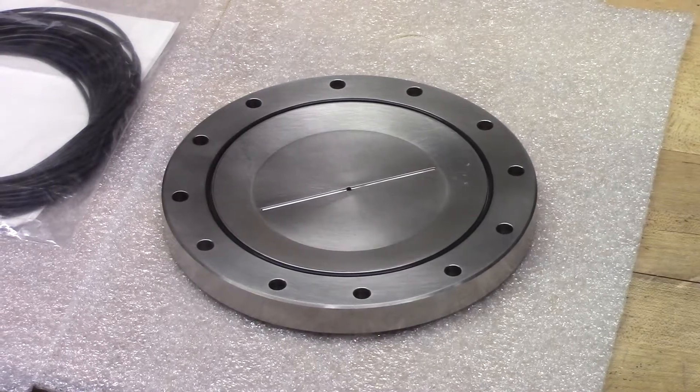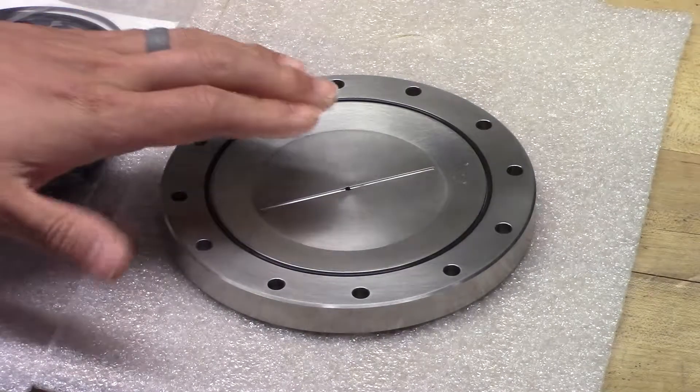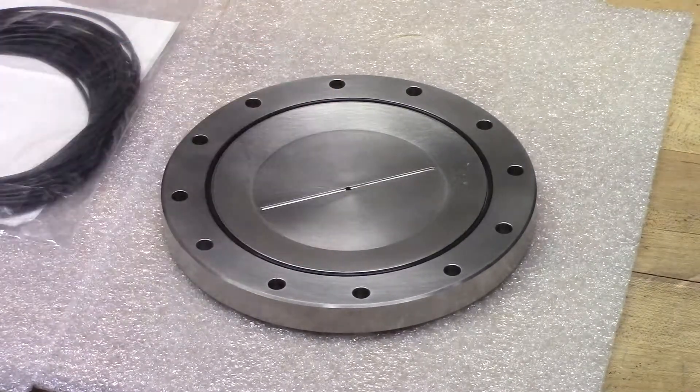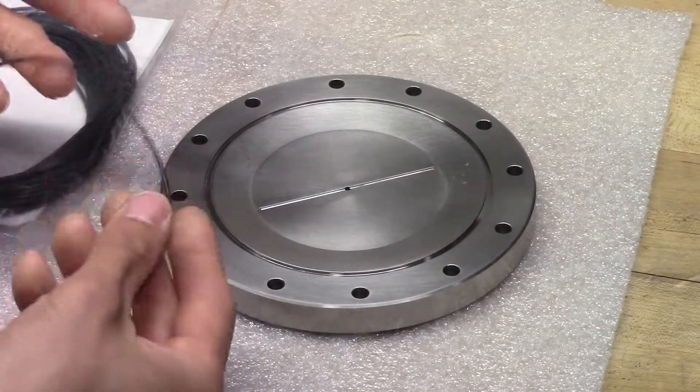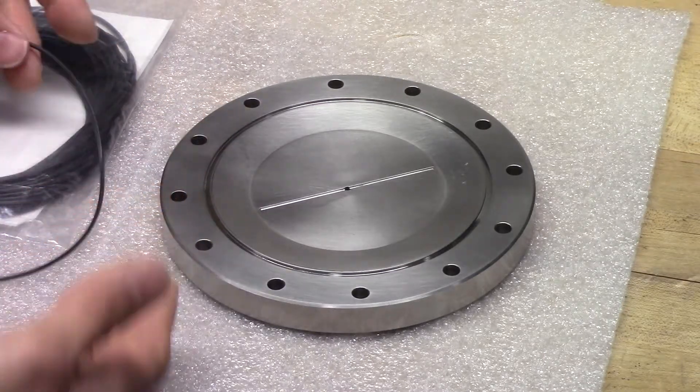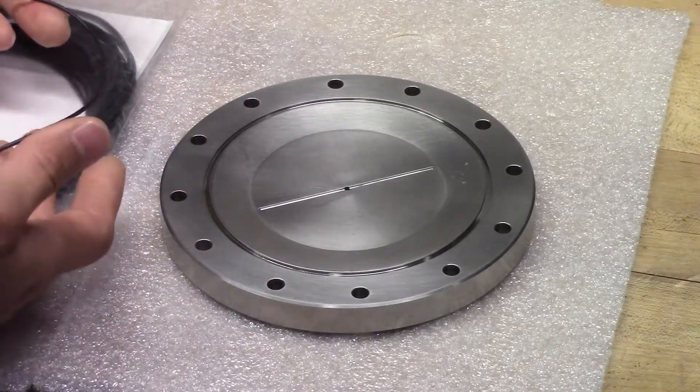Today we will be demonstrating installing an o-ring in one of our GS series reference caps. When you are installing the o-ring, you want to make sure the o-ring is laying flat from the packaging. If it is not, allow it some time to relax.